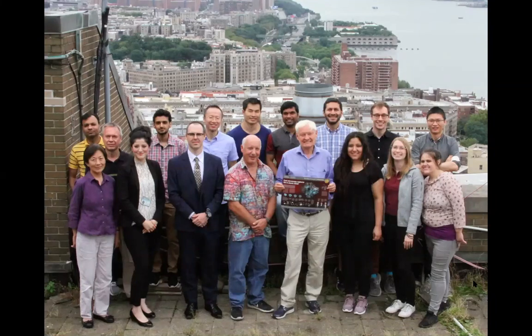It has been demonstrated by a group, and I can't remember the name of the group, that this is doable, and one can really achieve the same resolution as before if one uses some kind of particular tagging technique. Yeah, thank you. I'll see if there are any questions coming up.